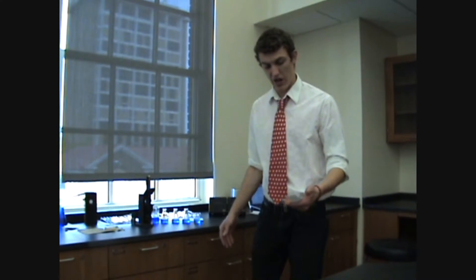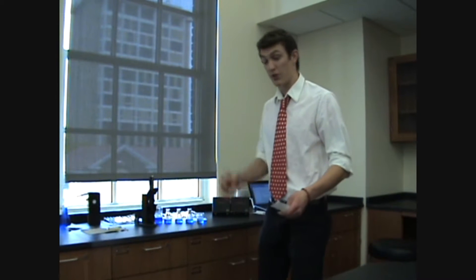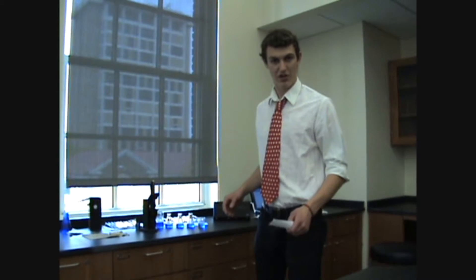But, like most colorimeters, there are advantages, such as you can quickly look at the color to determine the concentration. And if you have a really keen eye and you're good at it, you can find the concentration pretty well.